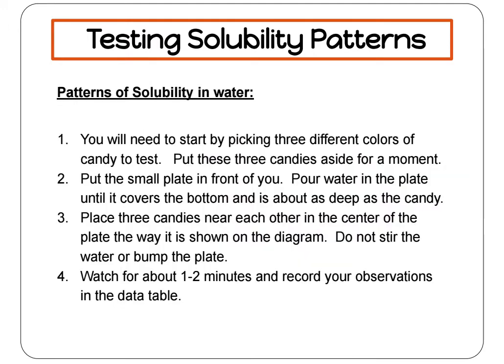Pause the video now to test out solubility patterns yourself. You can follow the procedure on the screen for your experiment.